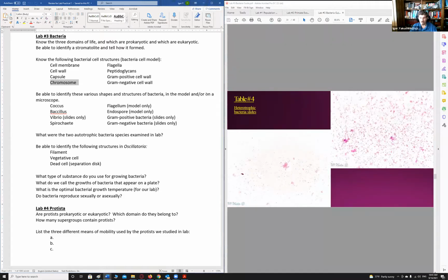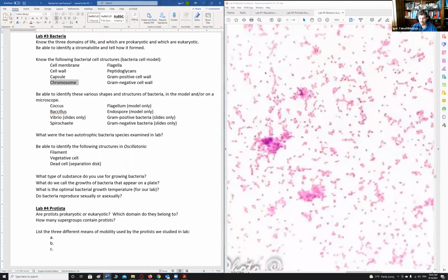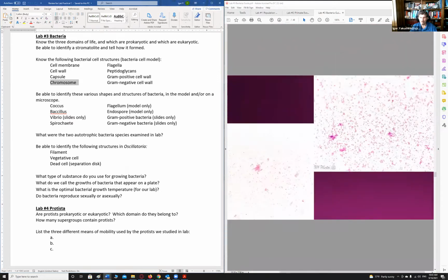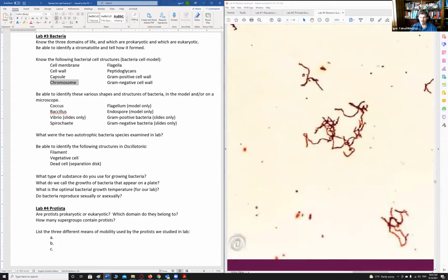Next one are the gonorrhea, and those ones are clusters of tiny little bitty round things. So that would be cocci. Here we have a treponema. As you can see, it's kind of brownish reddish, and that one is the spirochete. You can say it doesn't really look like a spirochete.